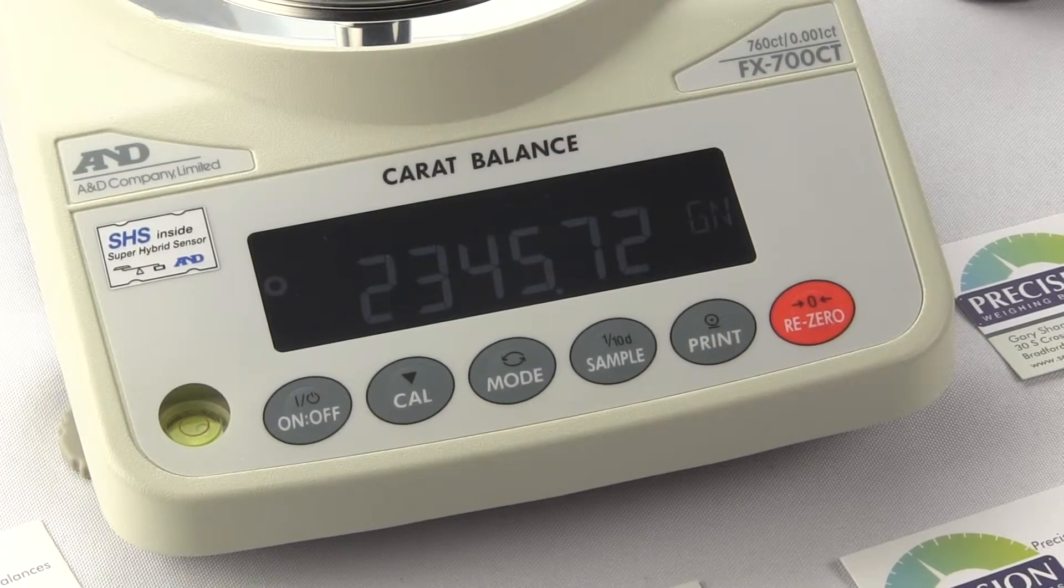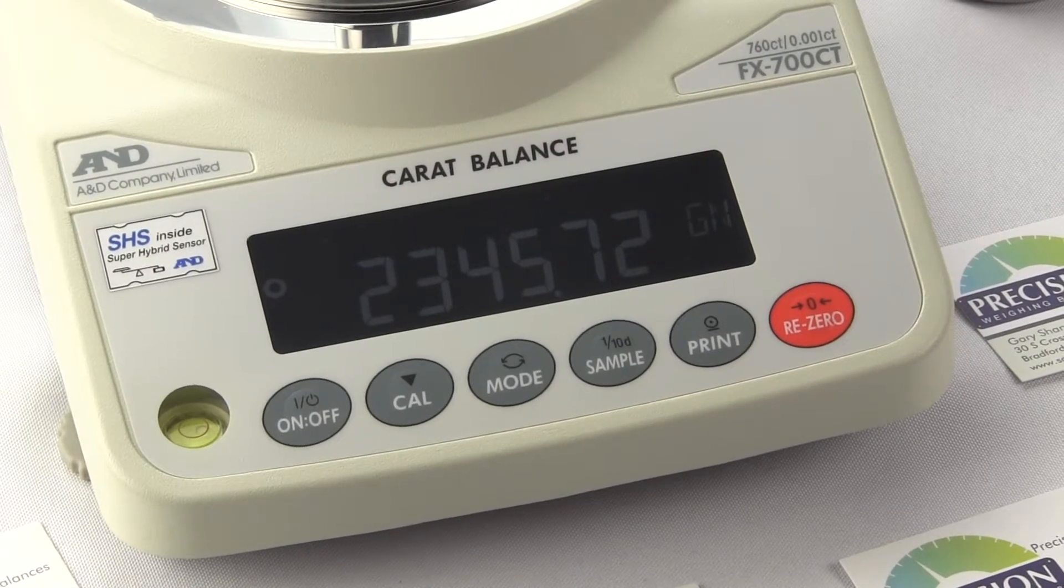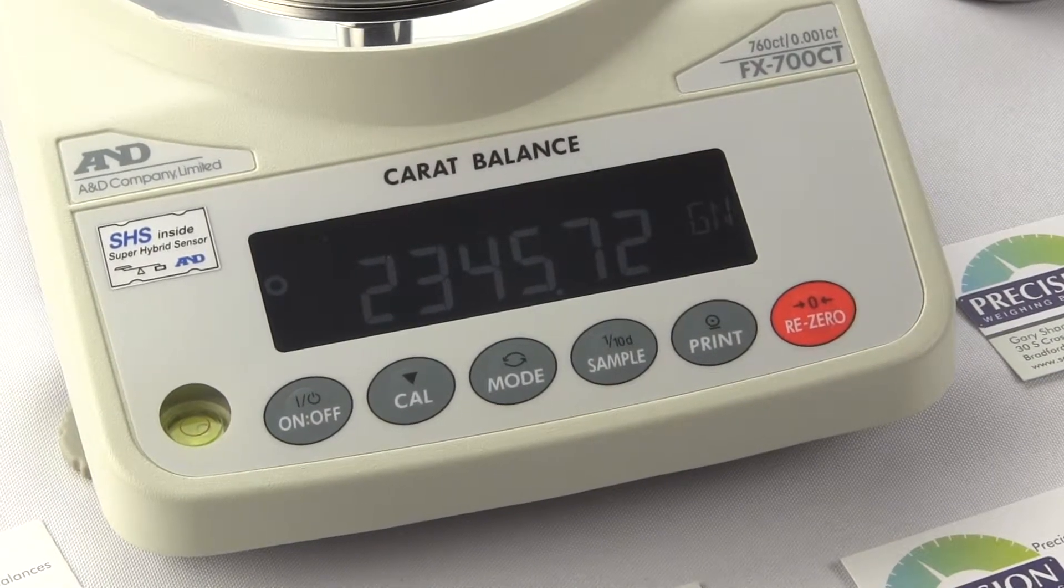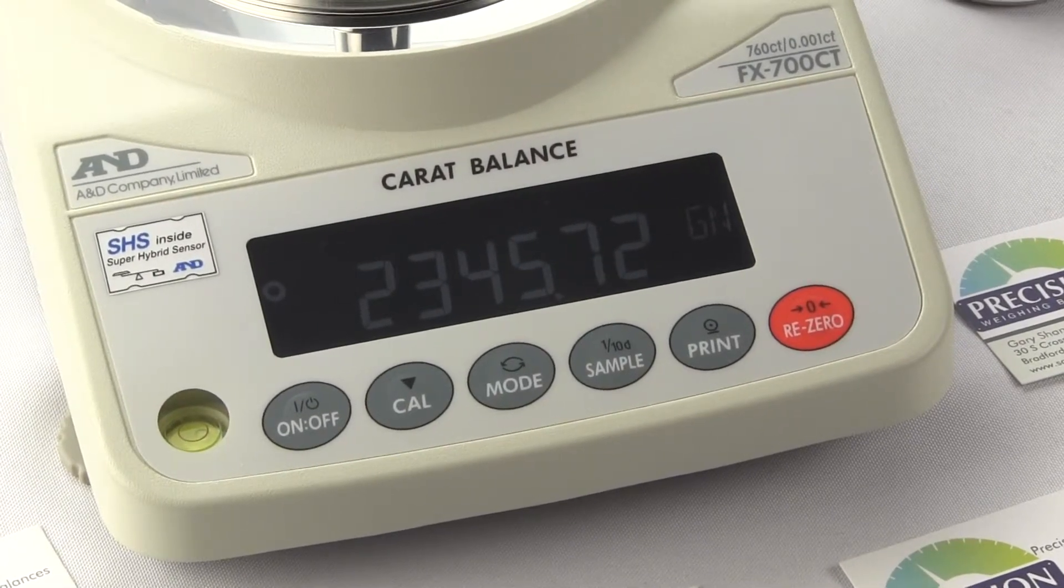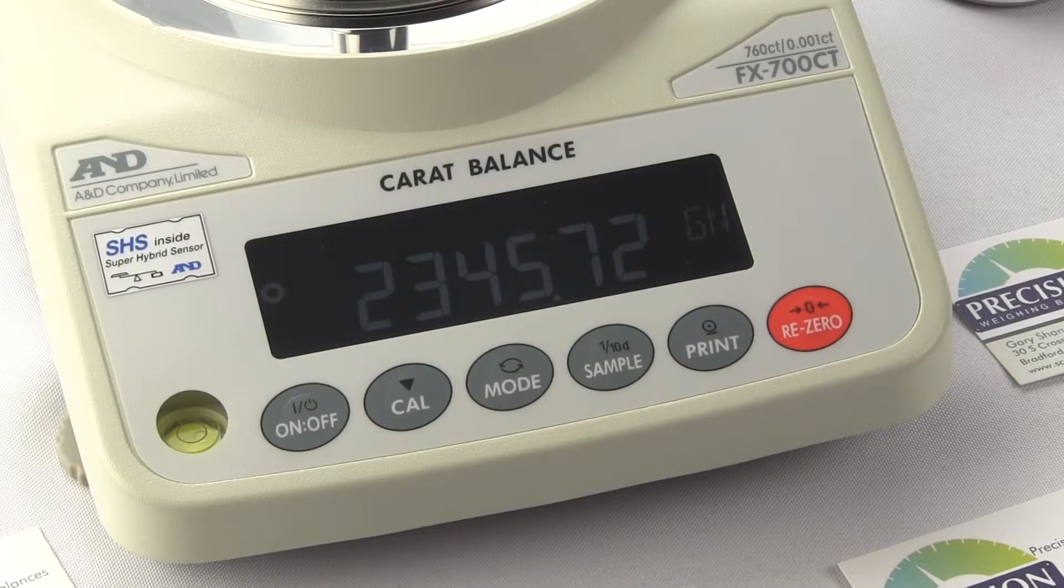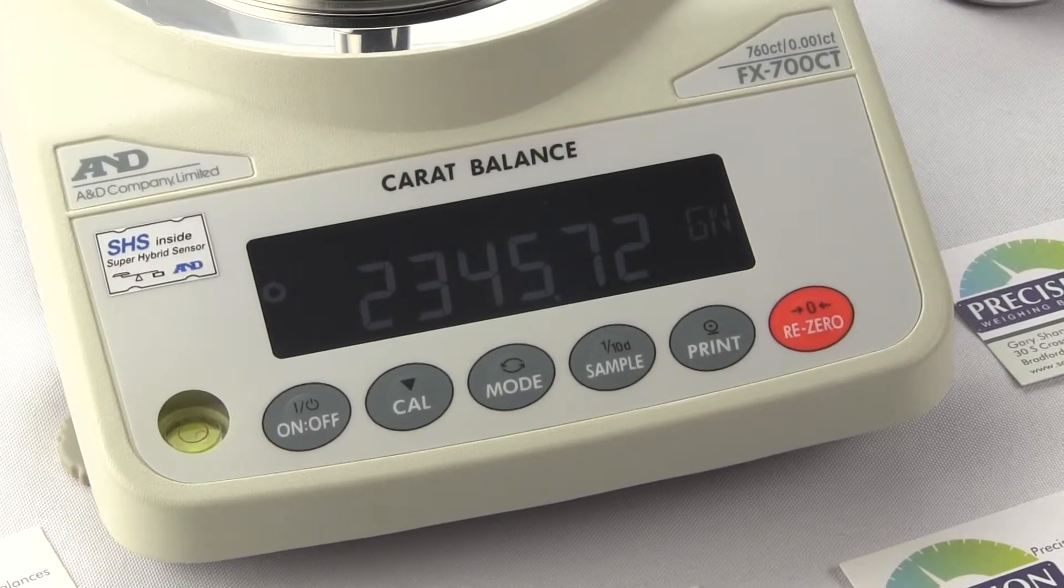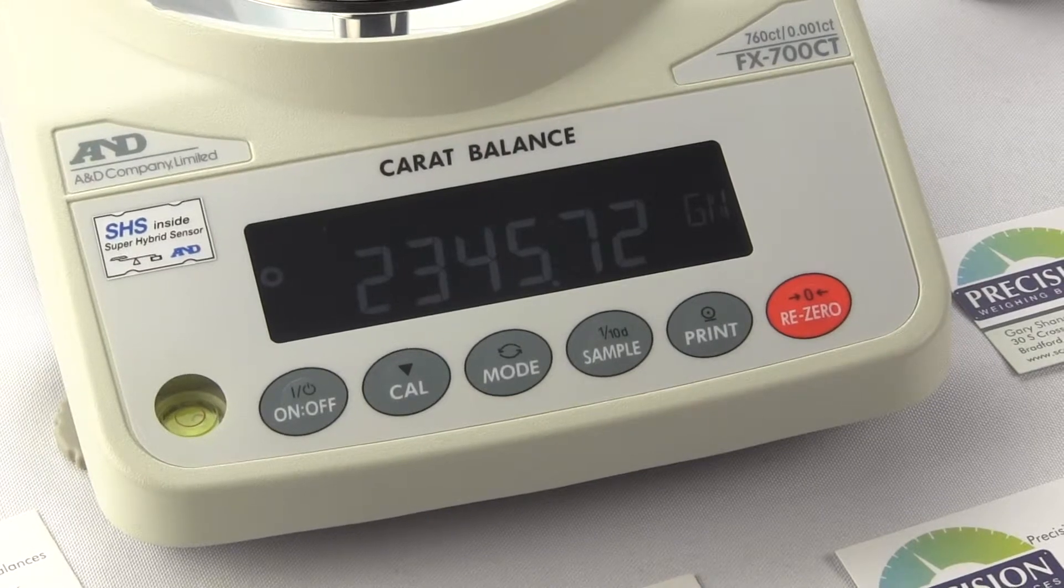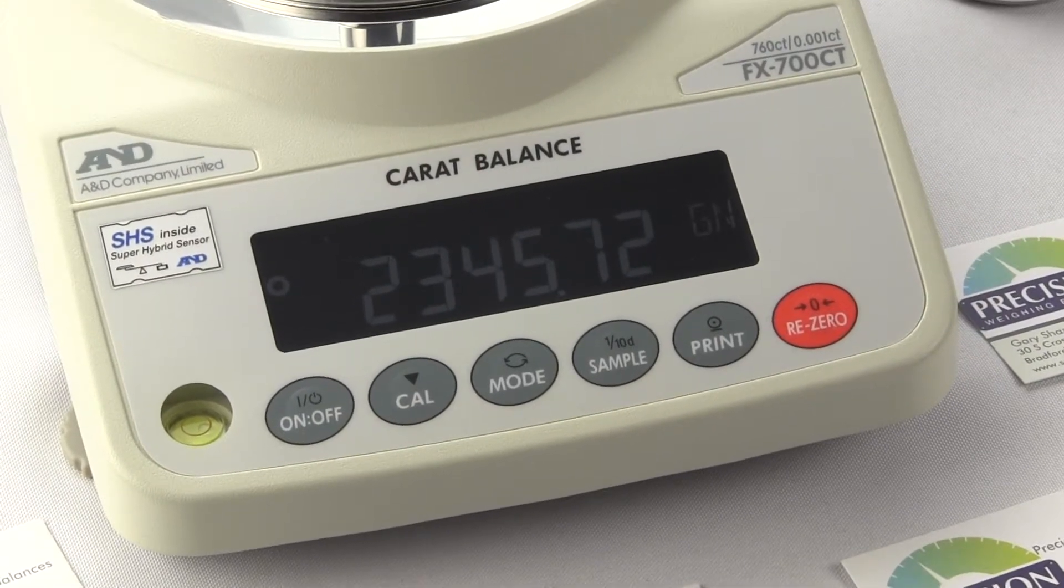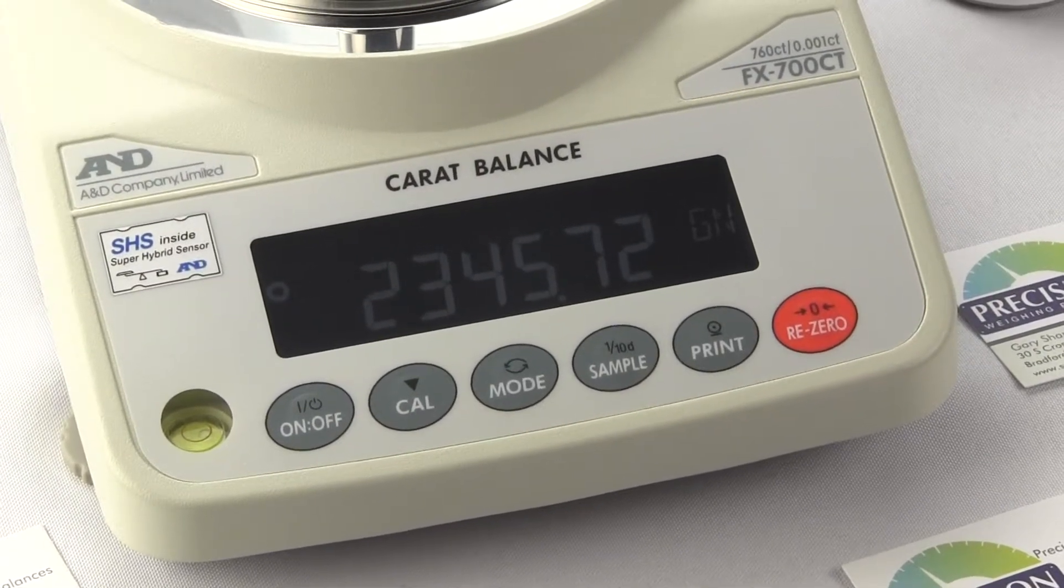So if you're a competition long range shooter shooting over 400 yards and especially anyone over a thousand yards we still recommend the Sartorius Entris 64 over the FX700CT. That's because the Entris is 10 times the readability and for competition shooters they want to know every single round is to the kernel.